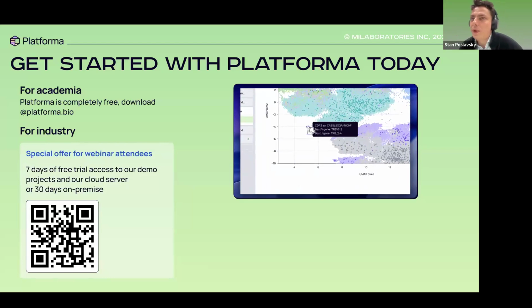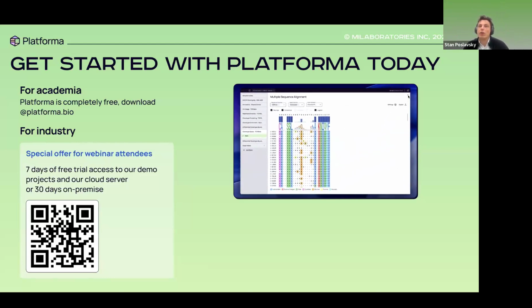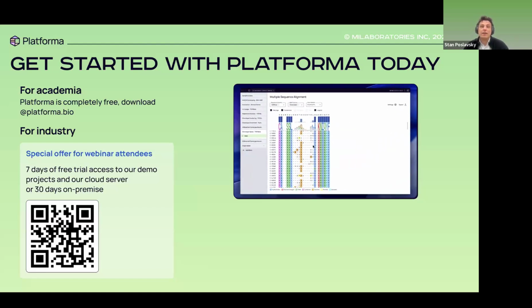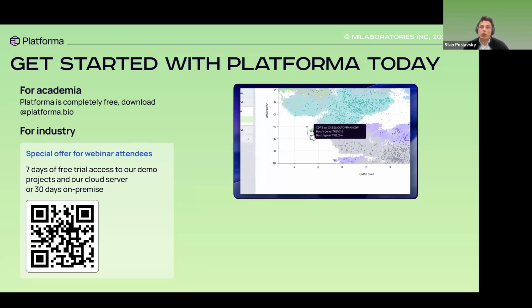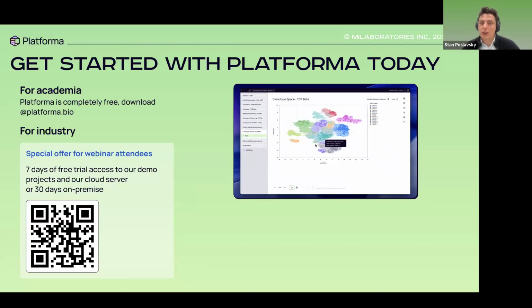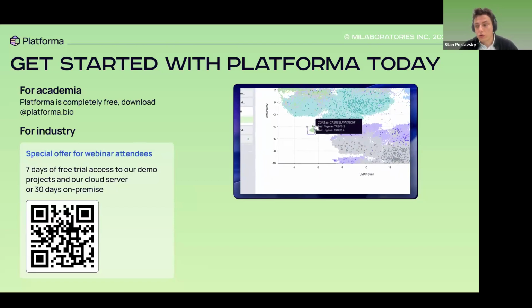For some challenging campaigns where you don't have that nice enrichment and things are not going well, it may improve the results. But so far, in many, many campaigns that we saw in industry and academia, what's really important is just the negative control. Having replicates or parallel enrichments does not add much when you come down to the final list. But negative control is essential, super important.